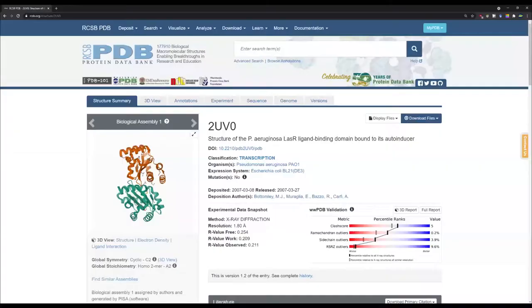Today I'm going to show you how you can extract the information of the residues that are present in the ligand binding pocket. There are amino acids in the protein, and when a molecule is bound to a specific protein molecule, it is bound to those amino acids — that is what I'm referring to as residues. So how can you extract that information using PyMOL? It is really important when you are trying to understand or compare the effect of any drug molecule on the protein structure.